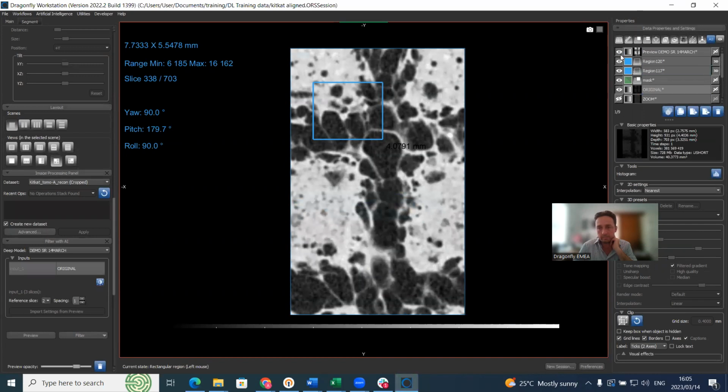And that's the result. Not too bad if you look at that. So it does do an improvement, even in such a short demo. So that's it. That's all I wanted to show you here.